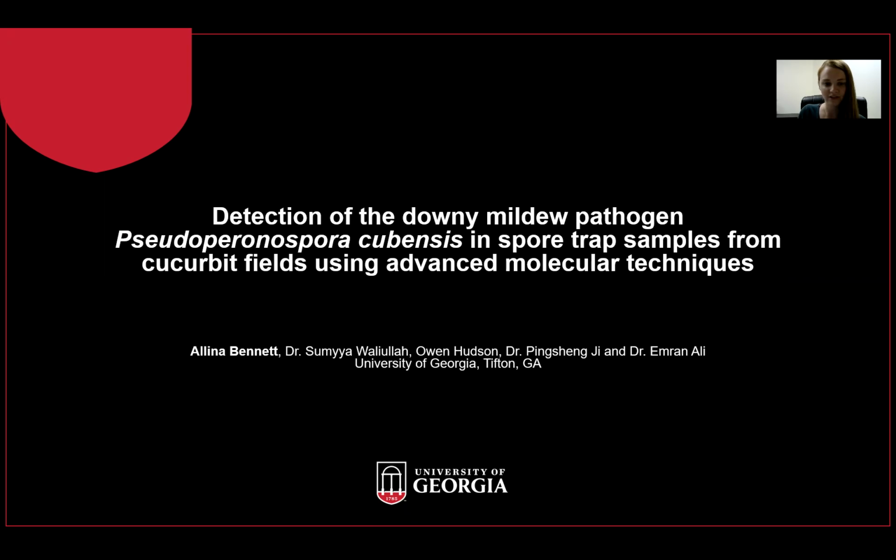I'm a master's student at the University of Georgia Tifton campus, where I also work at the molecular diagnostic lab here. Today, I will be talking about the detection of downy mildew pathogen Pseudoperonospora cubensis in spore trap samples from cucurbit fields using advanced molecular techniques.